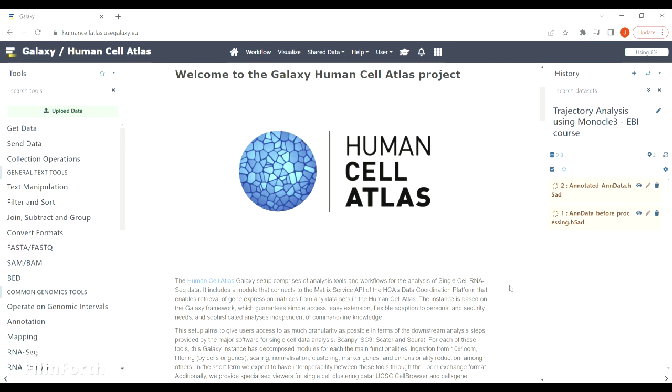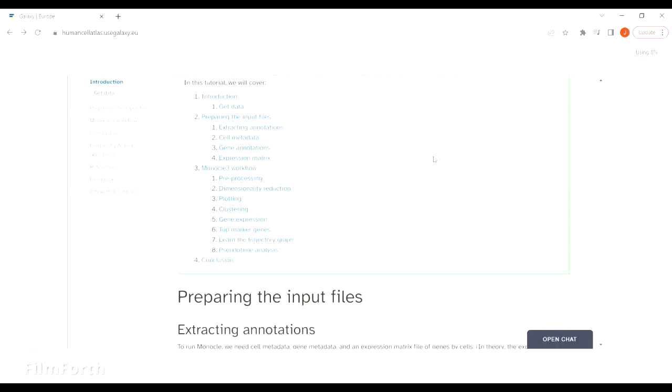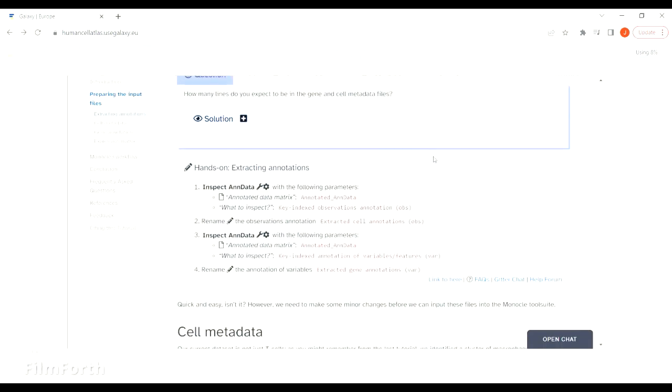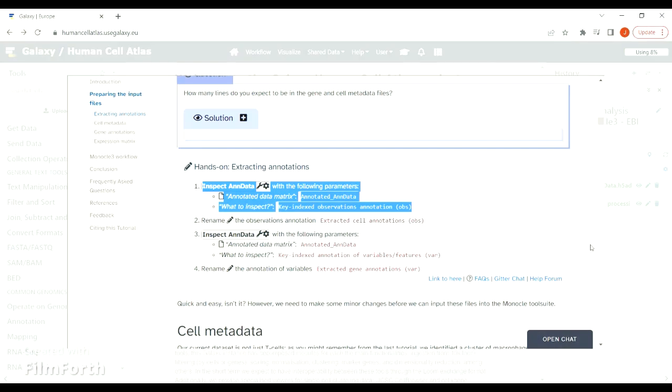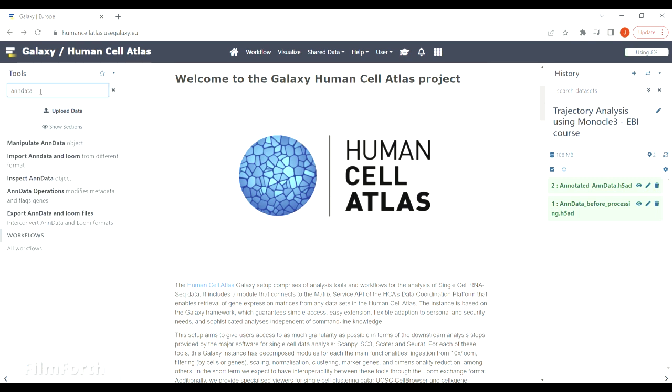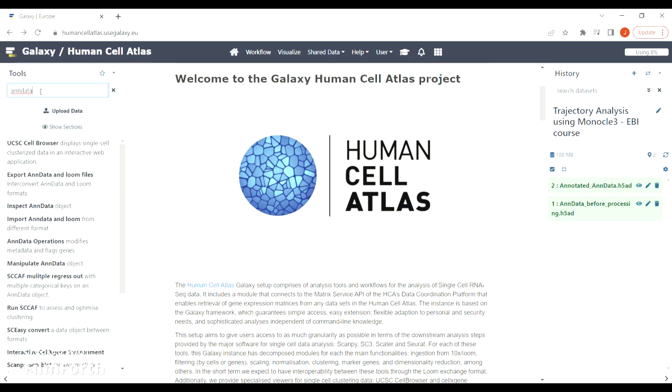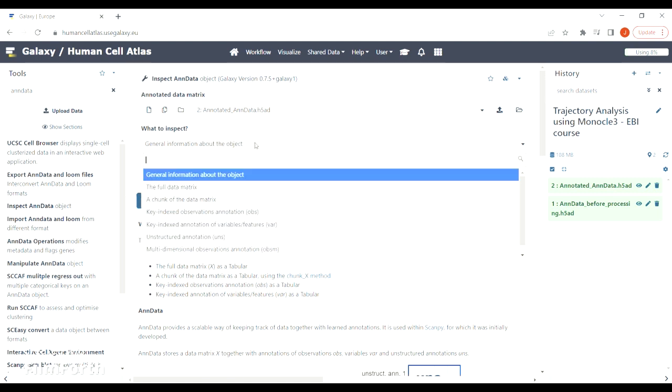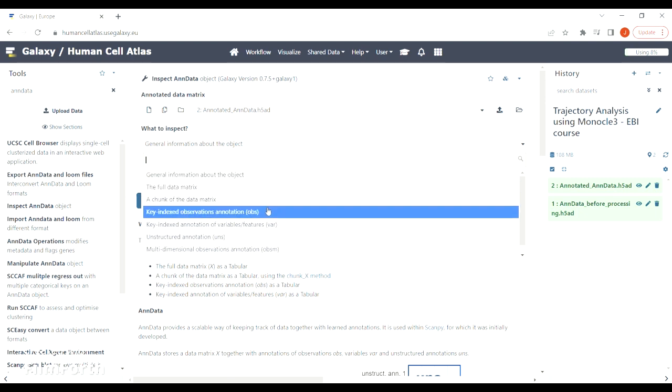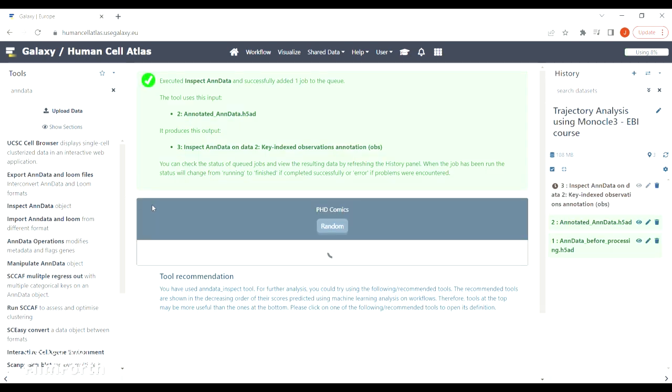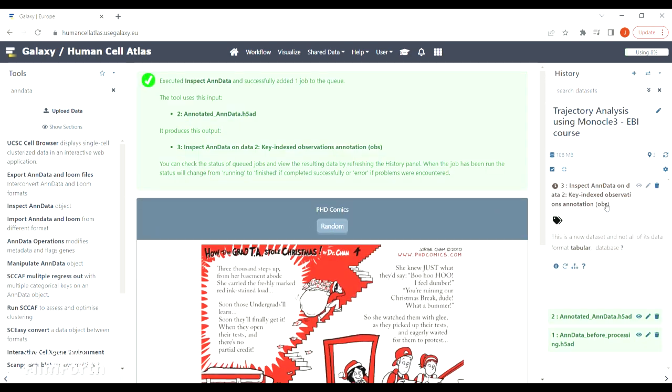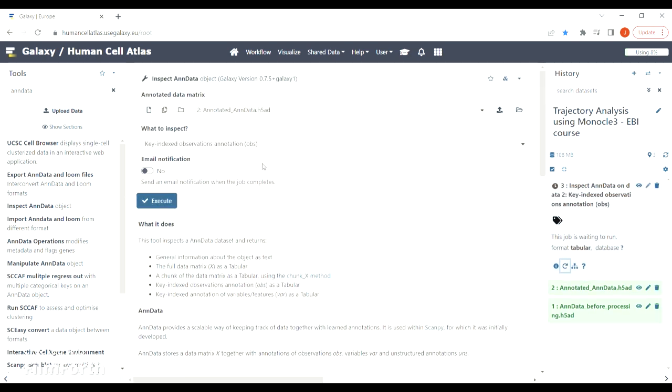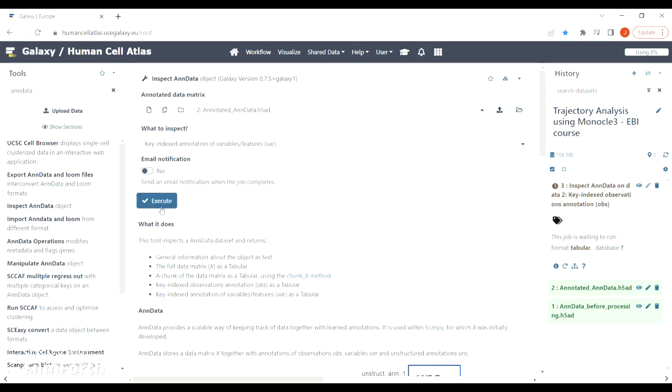Once it's loaded, navigate to tutorial mode again and see what is the next step. Normally those tools should be clickable, but if they're not just go to the search box and type the name of the tool. We are now extracting observations and variables from anndata. If you don't want to type the name again, just click on the repeat arrow and change the parameters.